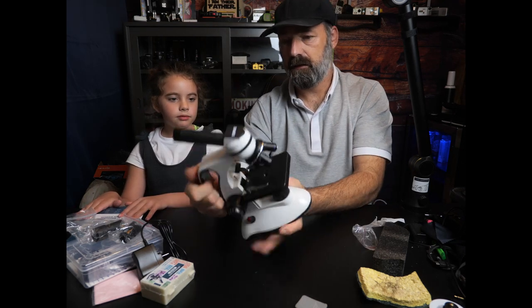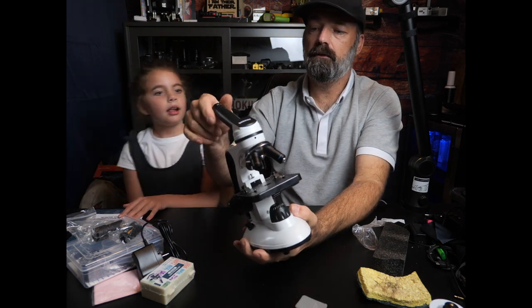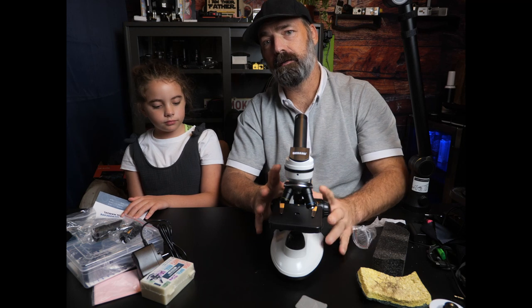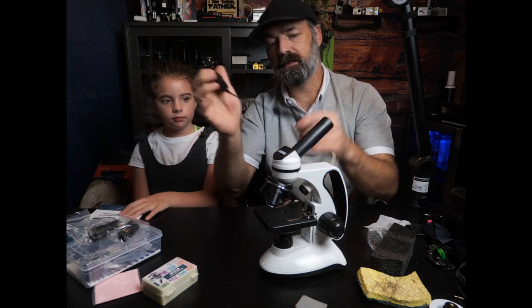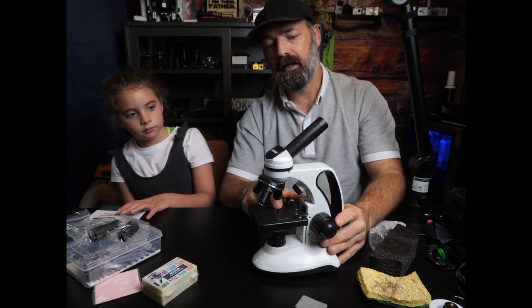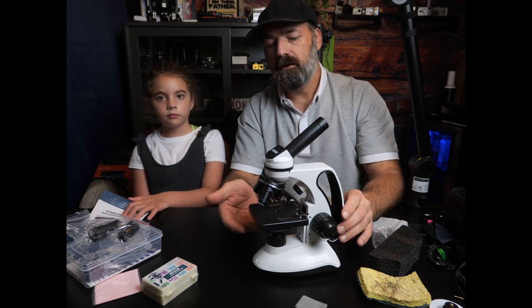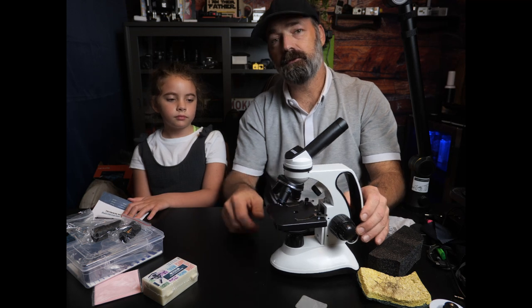This is like a scientist one. It actually has a metal body, which is pretty cool. It has these interchangeable eyepieces that just pop in and out. You do get a power cord because it has double LEDs — one you can turn on from the top to look down, and if you're looking at something really small like blood or water, you can turn the bottom light on and it will shine light completely through the object from the bottom up to the microscope.